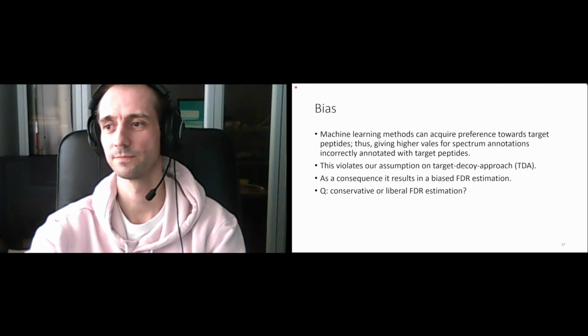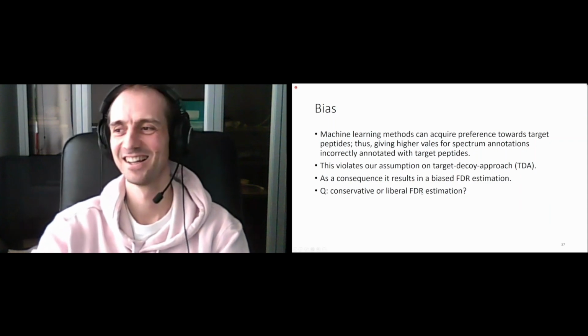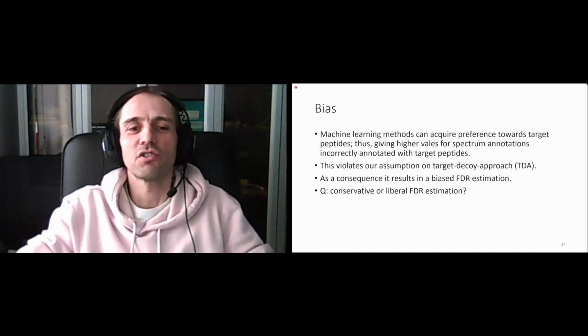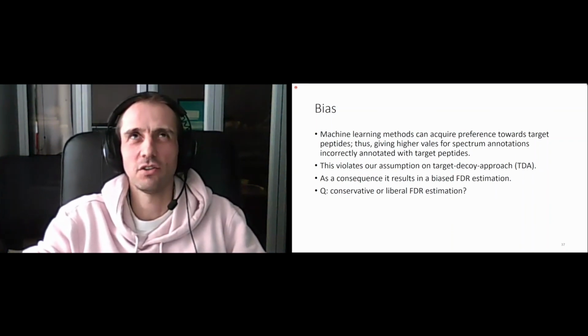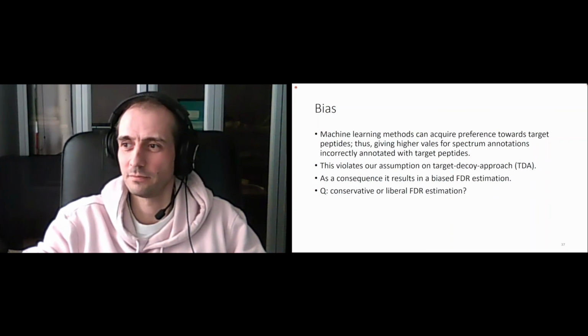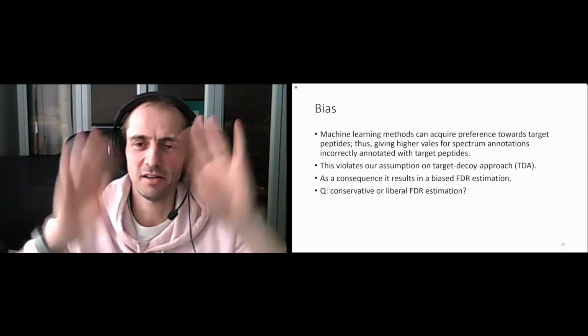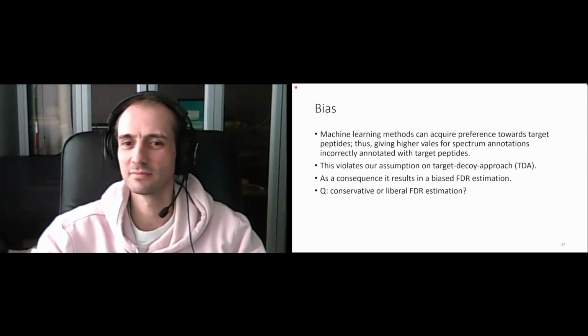Yeah, Bruno. I was trying to recall. Conservative means too high p-value, or the conservative means that the false discovery rate actually is lower than the actual. Conservative is like strict, and the liberal is more like the false discovery rate is higher.